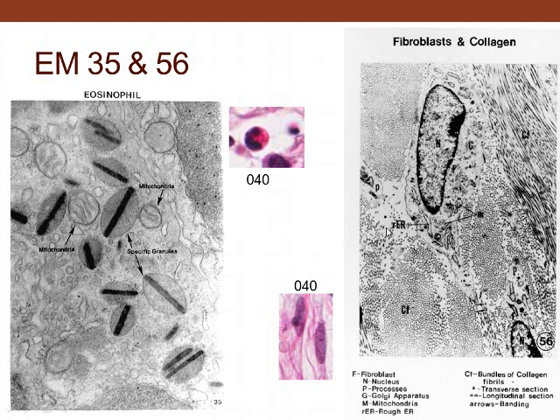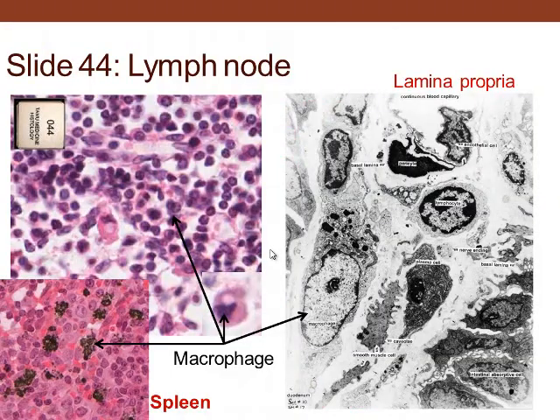Here is a fibroblast with various organelles including rough ER. What it produces is extracellular matrix — the collagen bundles. We can see cross-sections of individual collagen fibrils and a longitudinal section of the collagen bundles.